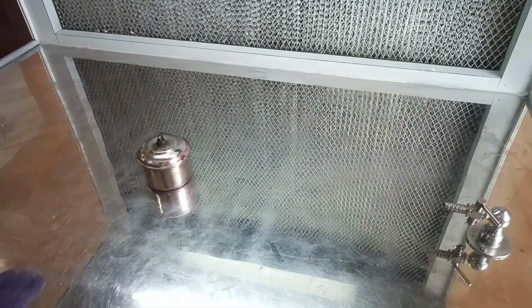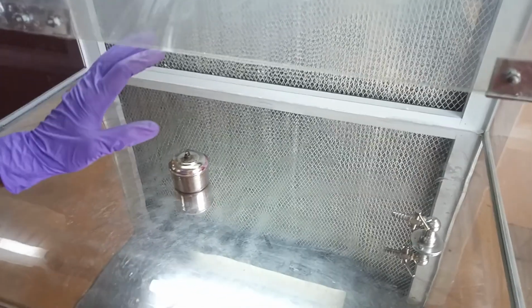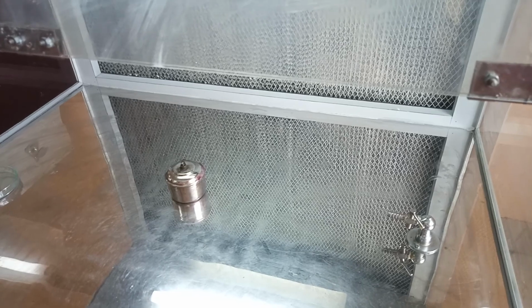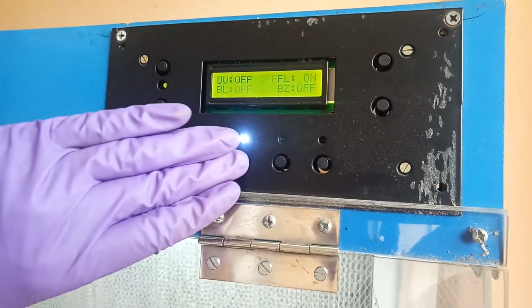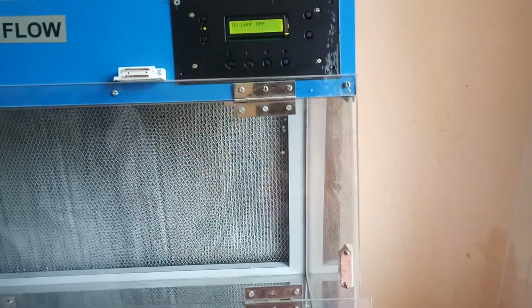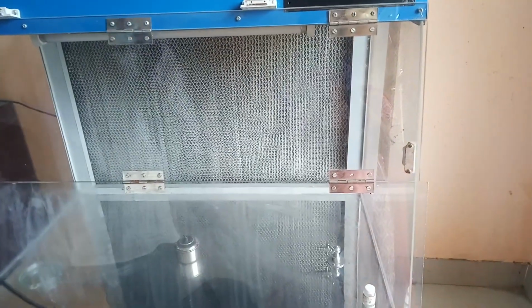After we are done with our work, we again close it down, and if there is a possibility of microorganisms being present, we switch off the blower and fluorescent light, and switch on the UV once again, so that all microorganisms that might have been present after we have carried out our work will get killed. Then at the end we switch off the UV and the job in the laminar airflow is done. So that's all about the functioning of laminar airflow.